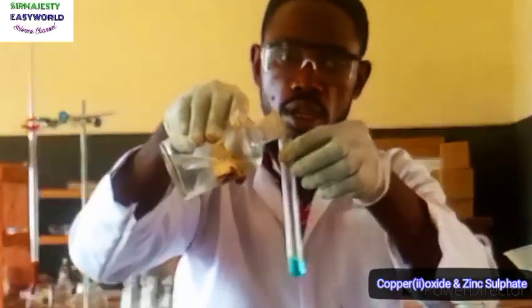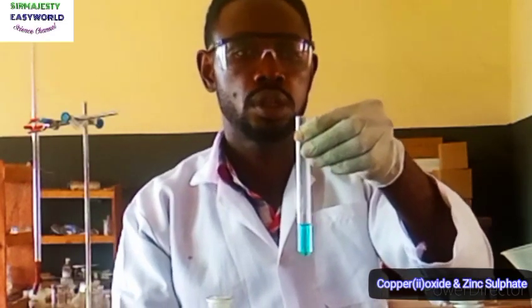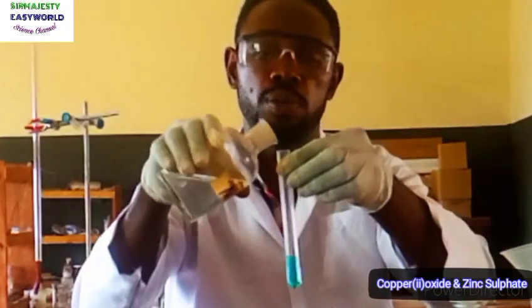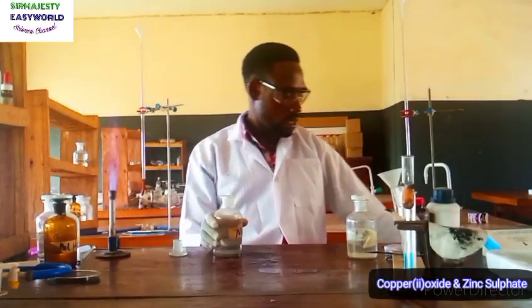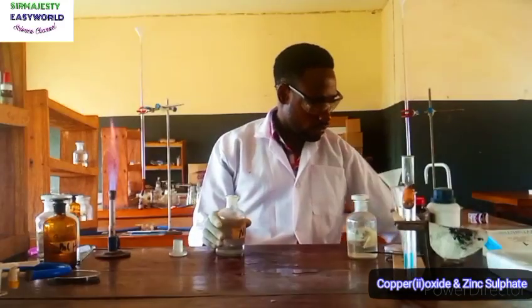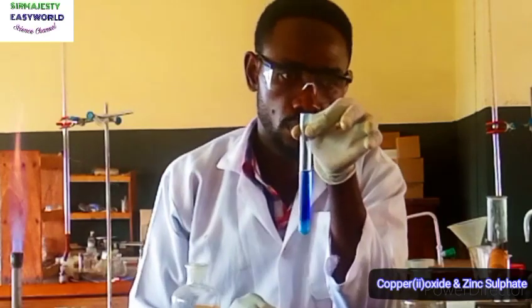So we are adding the aqueous ammonia in drops. In drops there was a light blue precipitate which has disappeared because excess acid is using up the remaining ammonia for neutralization. So you see the blue color coming out very well. This is a light blue gelatinous precipitate. Let me discard a bit so that I'll have space to add excess. Okay, then in excess, you see, it dissolves to form a deep blue solution.